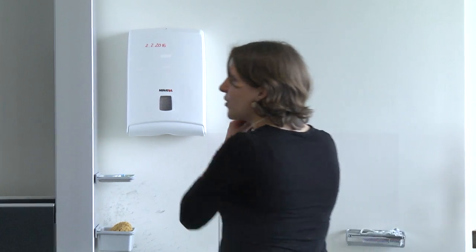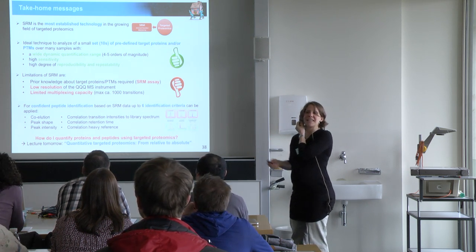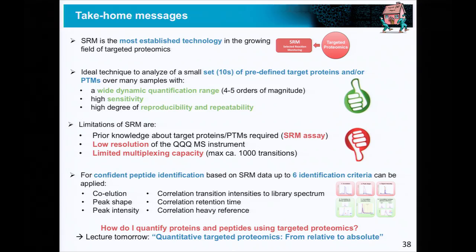Yeah, so I have only the take-home messages. Shall I? On the other hand, you will get the slides, so this is just the summary once more of what I told you, and the outlook that so far we have only talked about identification and not at all about quantification, which is of course the main purpose of doing SRM, but this will all come tomorrow.